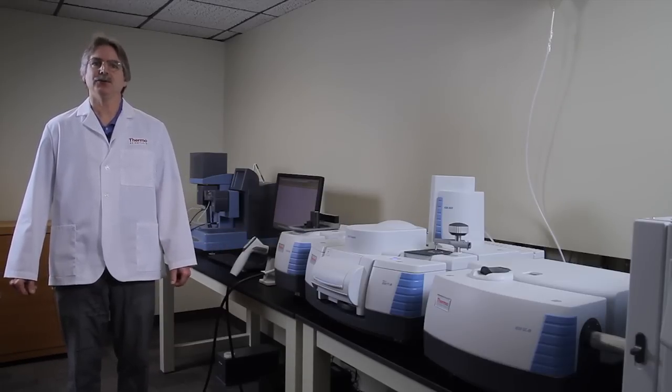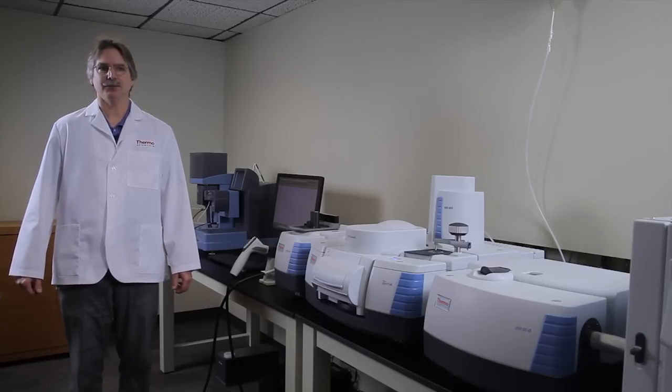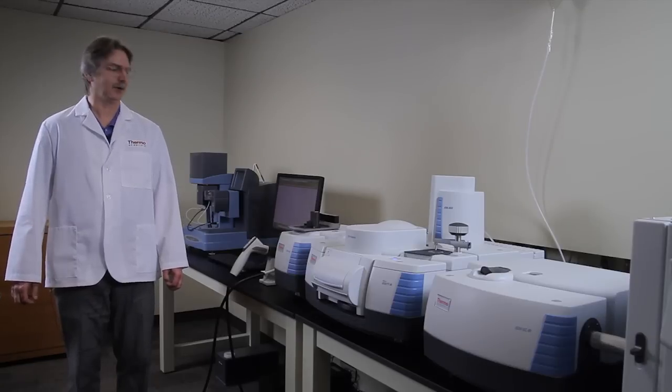The labs that would use this particular instrument are QC/QA labs who are looking at incoming materials, also manufacturers who might want to control their processes, and production facilities that would be building methods, chemometric methods, to do their analysis.